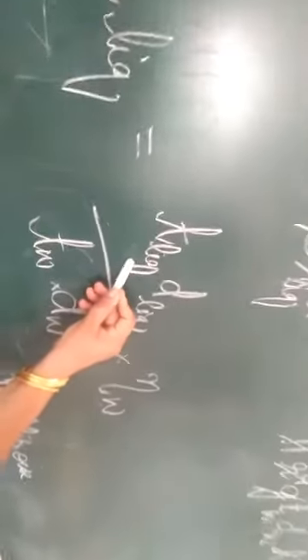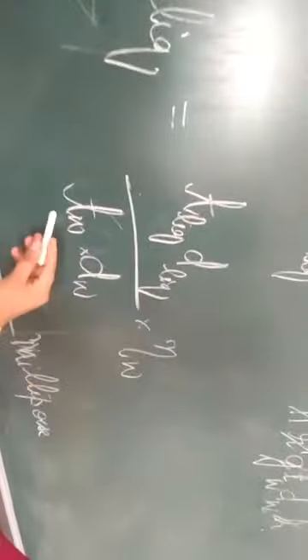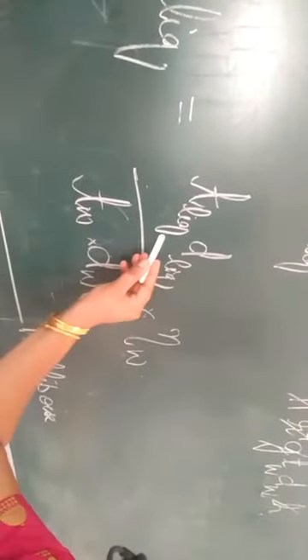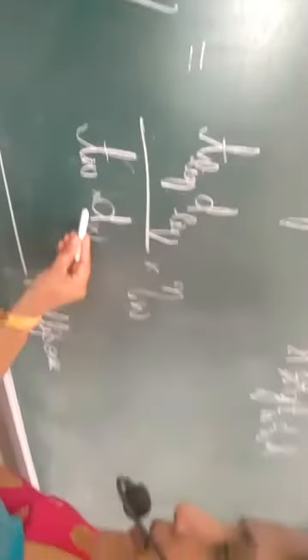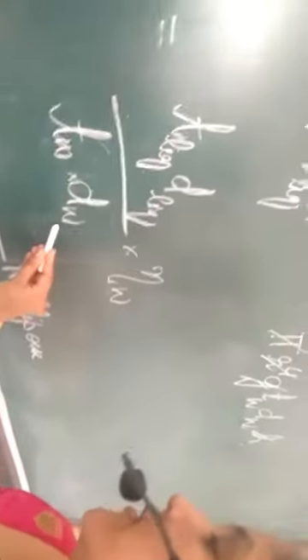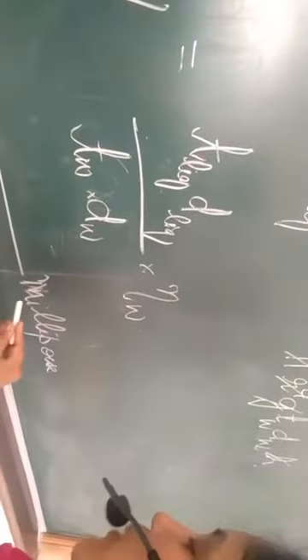Just now we have recorded the time flow for the liquid. Let us assume we have taken 61 seconds. Density of the liquid, here we went and saw in the chart, it is 0.863, assuming liquid 1. Now time flow for water, similar to the liquid, we have to find out. Density of water we have got from the chart. Viscosity of water also we have got from the chart. Now we have got the viscosity of the liquid.